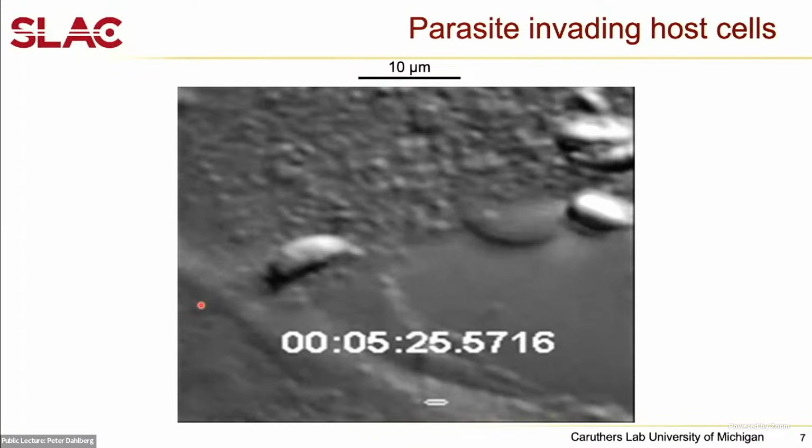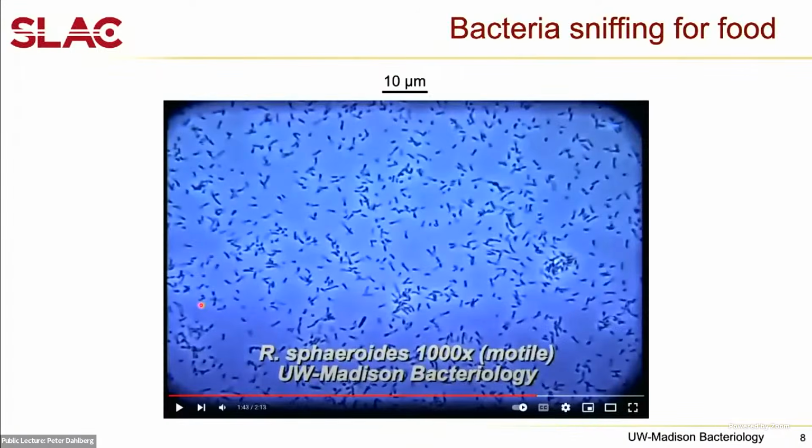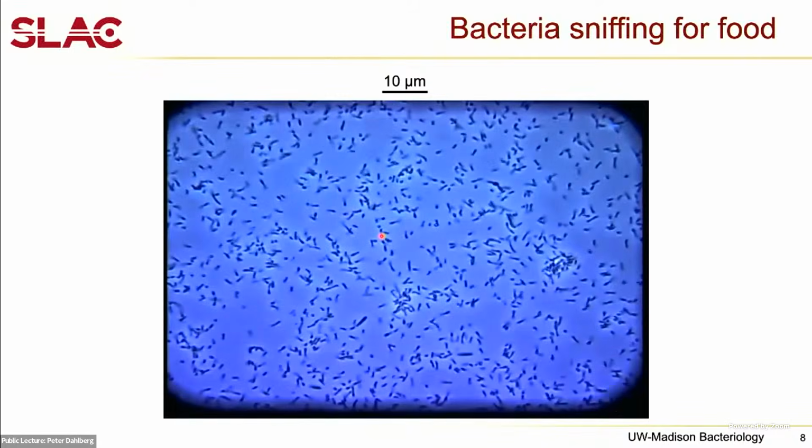So these are fairly complicated cells, Toxoplasma gondii and that white blood cell. But even if we look at the simplest cell, a bacterial cell, we still see incredible things. So here we're looking at a bacterial sample. Note the scale bar at the top. And there are many bacteria, I should say, in the field of view here. Most of them are fixed and not moving. But when I play this video, you'll see others zipping around in this cell culture.